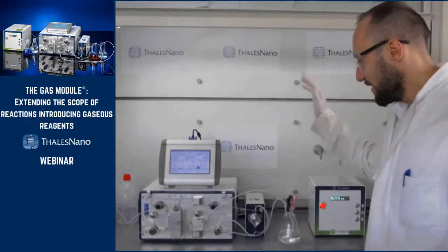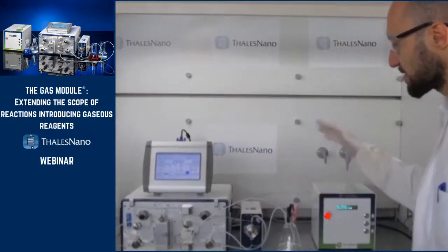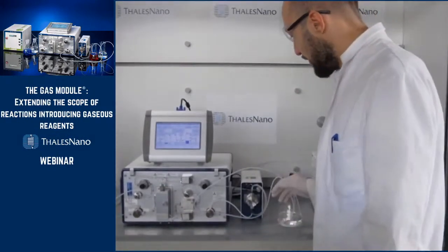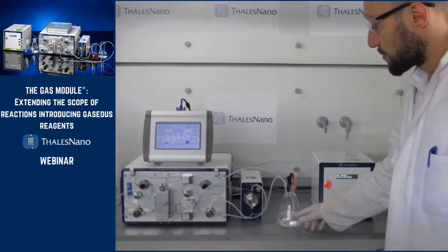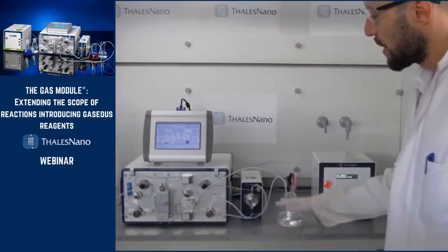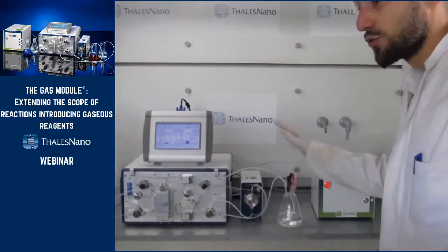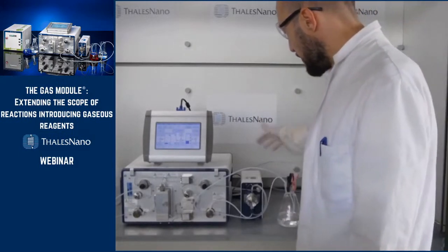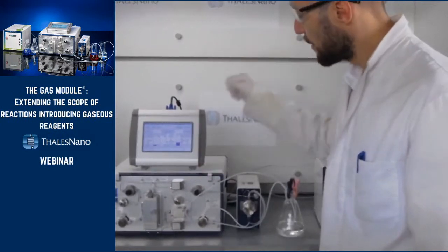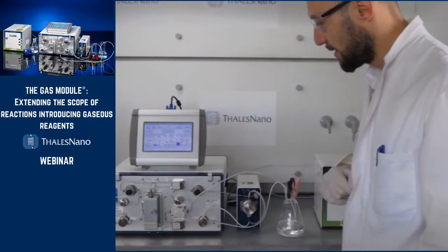It starts with the HPLC pump. It always starts with the pump, as you have to create the flow through the line. It aspirates the solvent through a two-way valve, which allows you to decide between the reactant and the washing solution. It creates the flow and goes to a first pressure sensor that gives you the pressure at the beginning of the line.